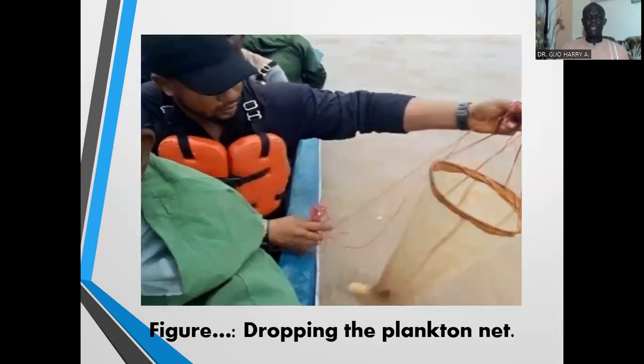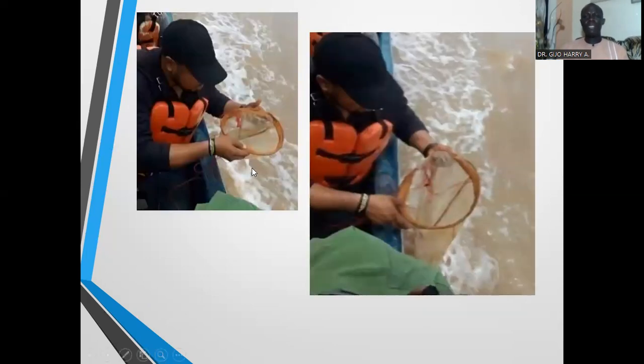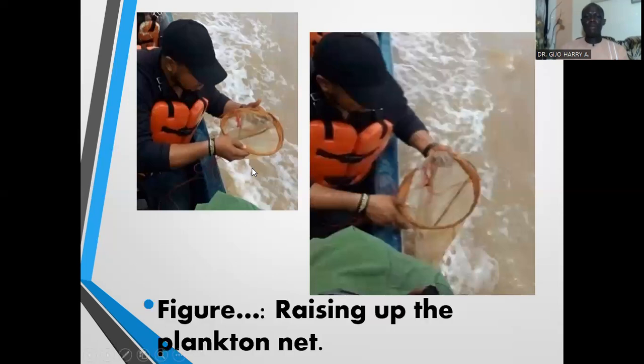Now, this is the procedure. First, you drop the plankton net into the water while the boat is not moving. Then when you drop the net, you propel the boat, and as the boat is moving, the net is used to collect surface water. You tow the net over a specific distance and over a specific time. Then the net is raised up and the planktons are collected from the bottle.